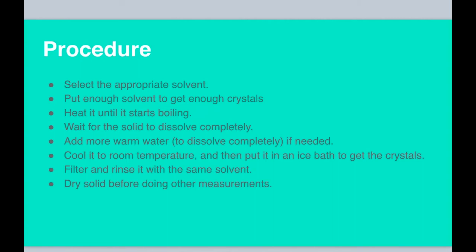It sounds like you can have a lot of solvent, but that's completely the opposite of what we actually aim for. Can you be more specific about this second item, put enough solvent to get enough crystals? I don't know what that means clearly.